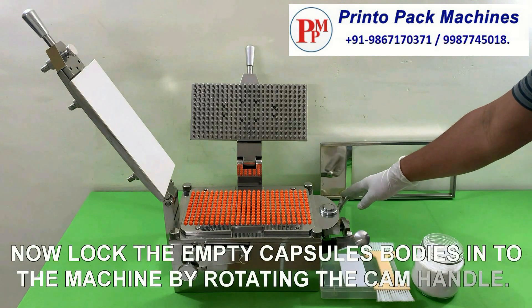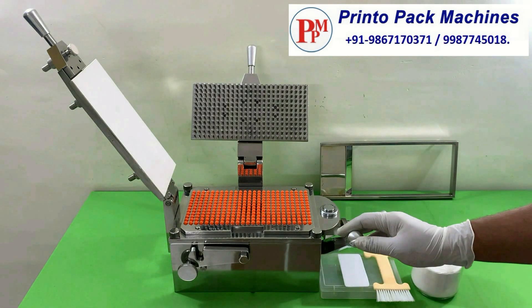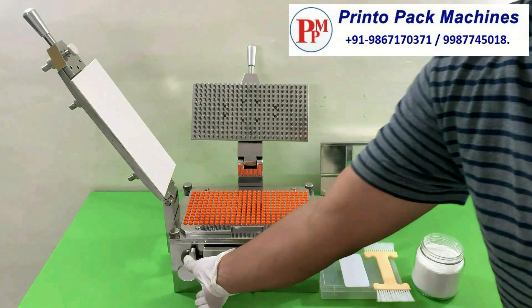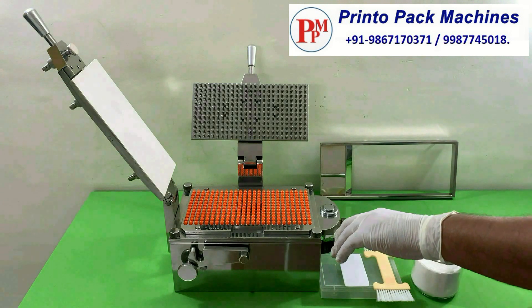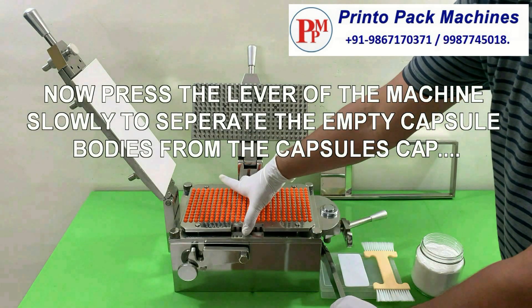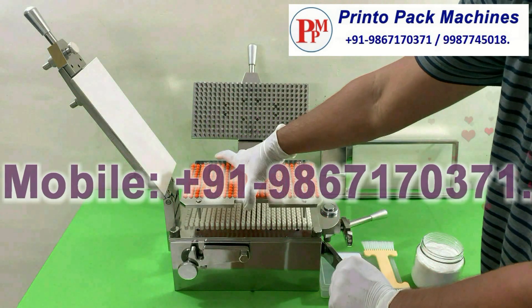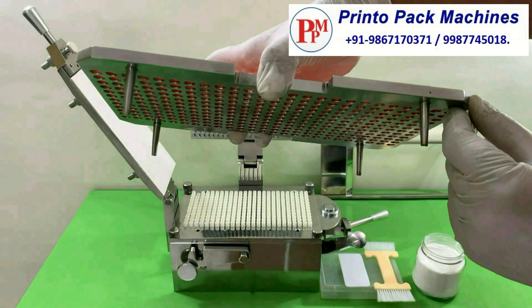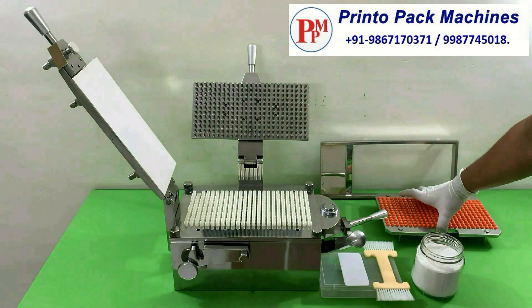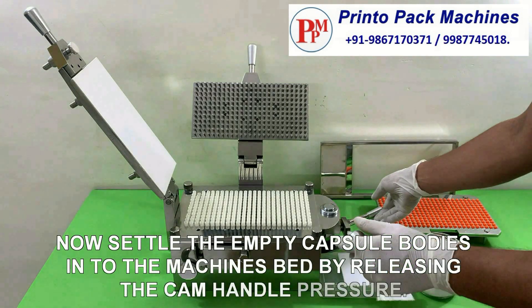Now lock the empty capsule bodies into the machine by rotating the cam handle. Now press the lever of the machine slowly to separate the empty capsule bodies from the capsule caps. Now settle the empty capsule bodies into the machine's bed by releasing the cam handle pressure.